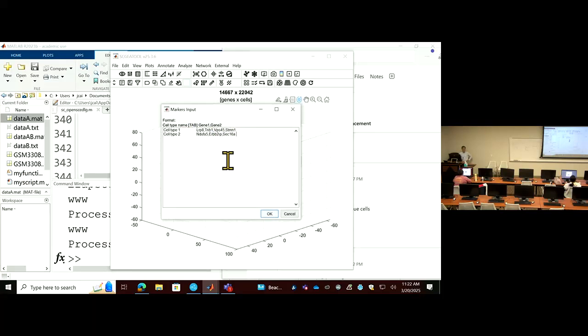Okay, so this is a small example marker gene database. You only have two cell types, cell type 1 and cell type 2. Cell type 1 contains genes highly expressed in these genes, and cell type 2 has these genes. This is just a toy example. It's not real.